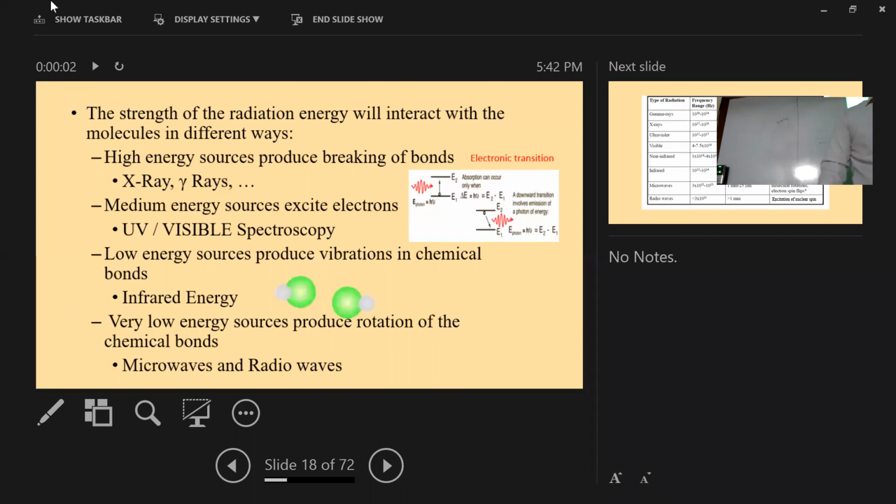Because infrared we can make, we have different types of crystals. So once we are generating this light, this is our visible light, we can double it. That means if we can double the frequency for this one, this is called frequency doubling. This is red.